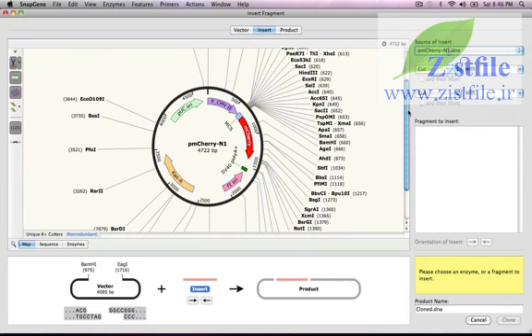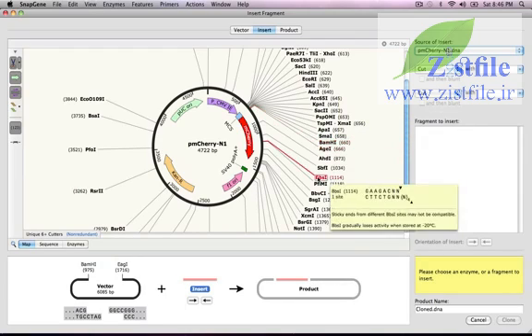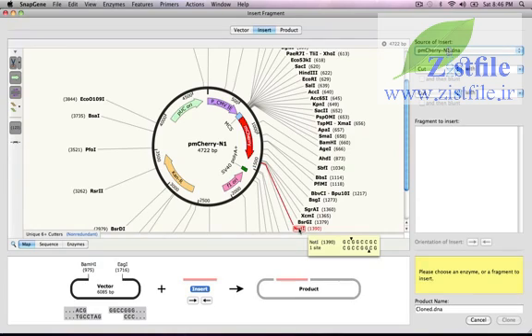The MCherry plasmid has a BAM-H1 site here that I can use, but it doesn't have a downstream EAG1 site. Instead, I'll use this NOT1 site at the end of the MCherry gene, because I know that NOT1 is compatible with EAG1.